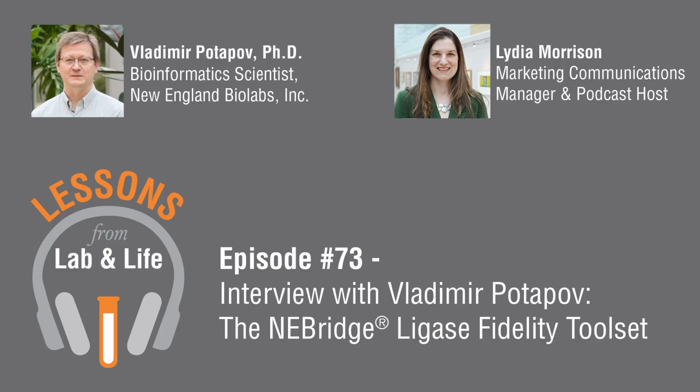I would say it's always project dependent. Sometimes the experimental part is the difficult part. Sometimes the computational part is the difficult part. But usually it always involves several iterations. And once you start analyzing your data, you start to find something you didn't expect that prompts you to either change your experiment or change the analysis workflow.